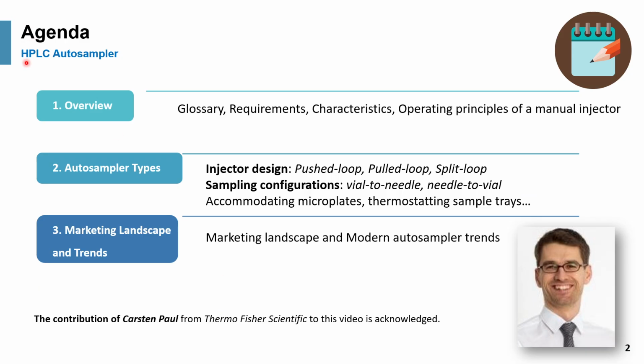This is our agenda. We start with an overview, which contains glossaries, requirements, characteristics, and the operating principle of a manual injector. Second is different autosampler types, focusing on injector designs and sampling configurations. And finally, some market landscape and also modern autosampler trends.